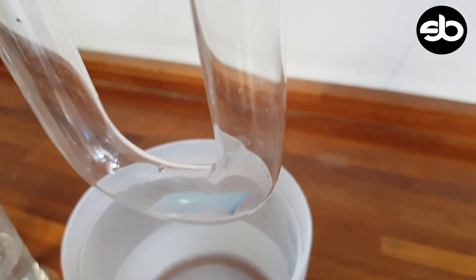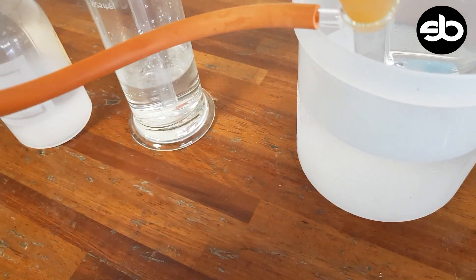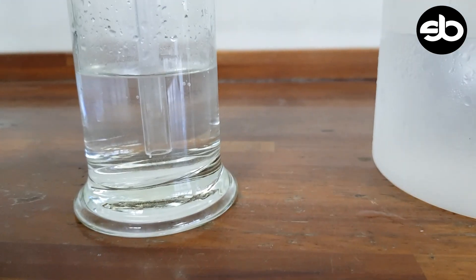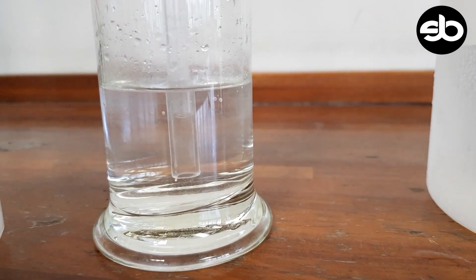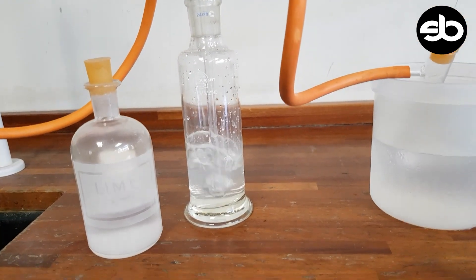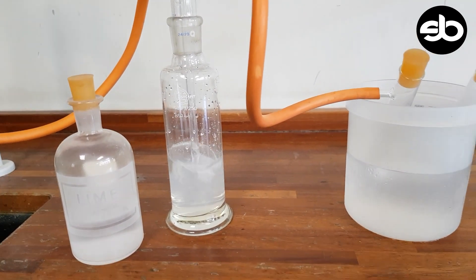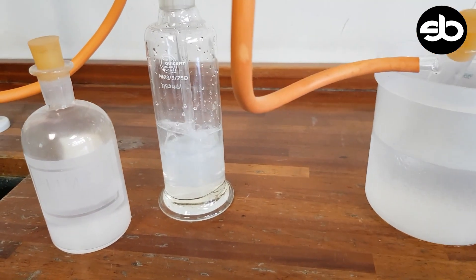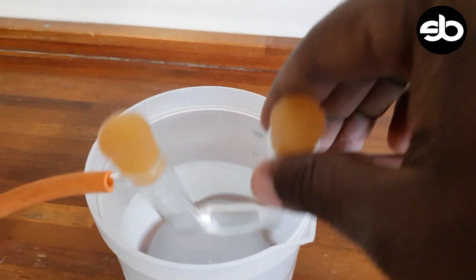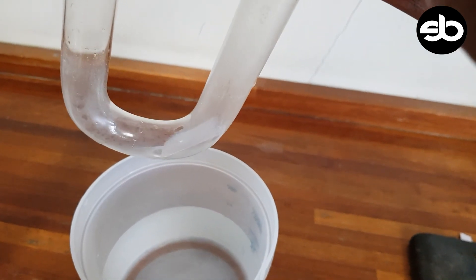The cobalt chloride paper is changing color — let me take it out for a minute. Our lime water is also changing color; the carbon dioxide is coming through. You can see what is happening with the lime water, and let's also check what is happening with the cobalt chloride paper.